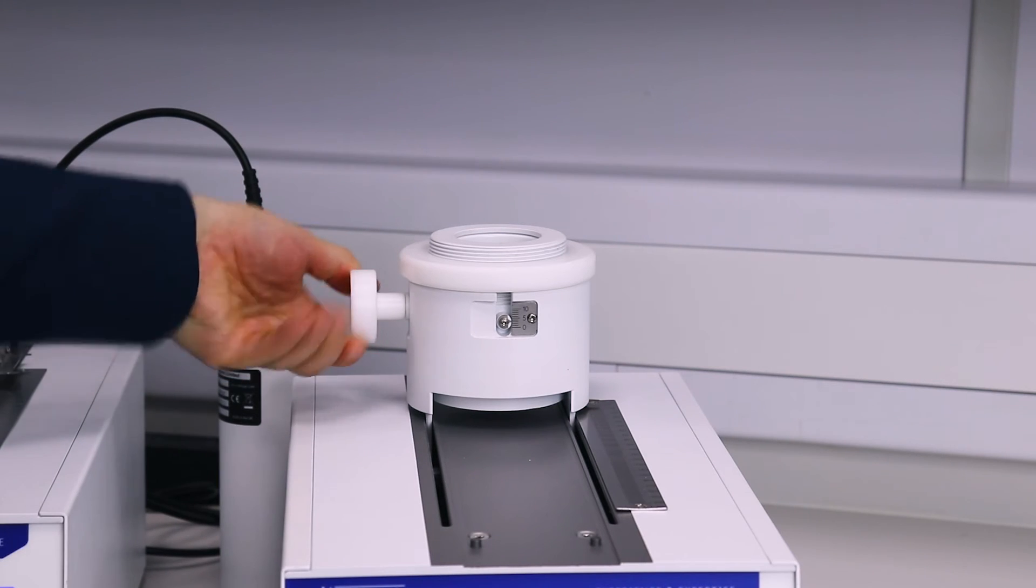The detector sits in an easily adjustable collimator and is driven by a very smooth motor where it collects data across the length of the TLC strip.